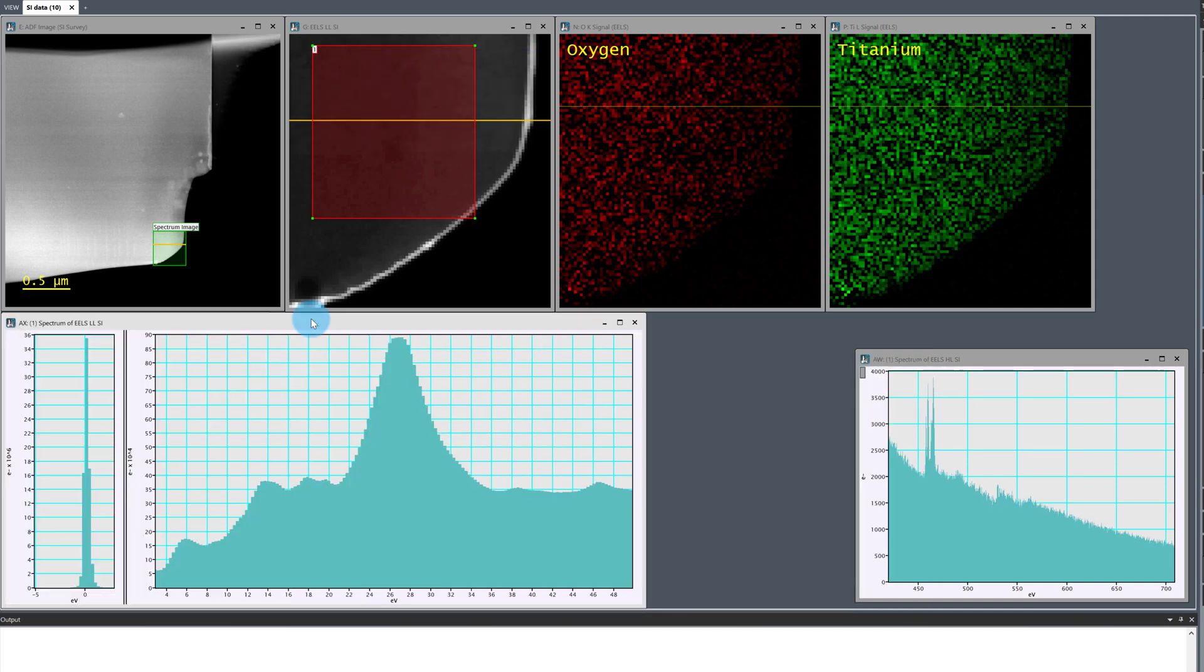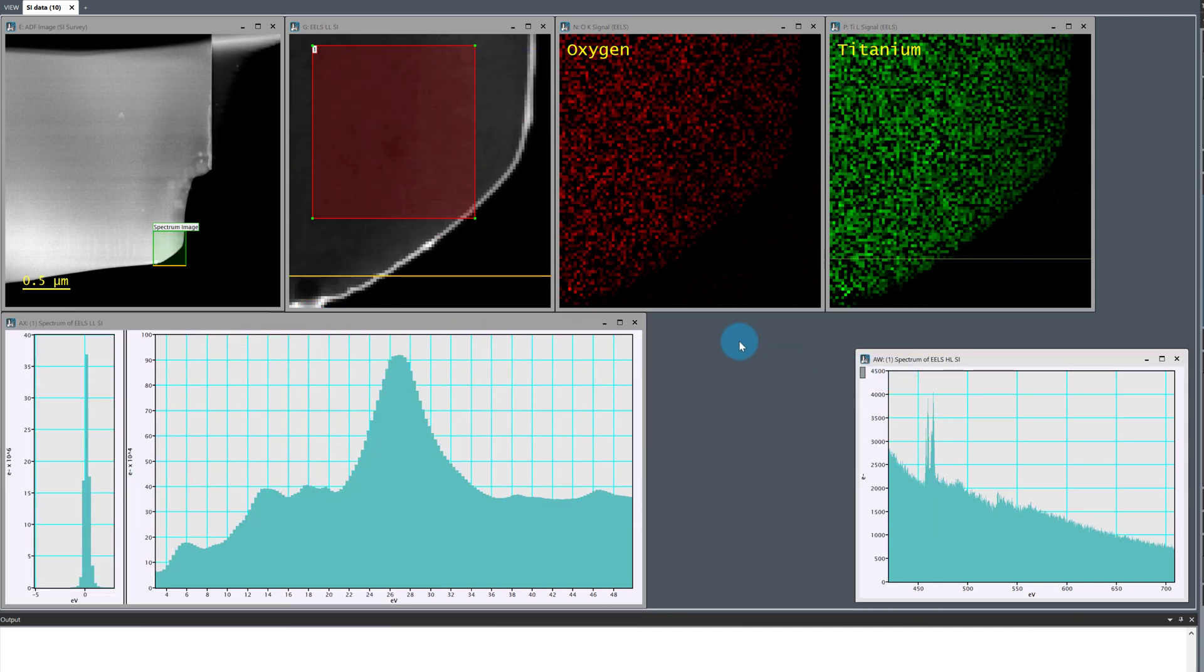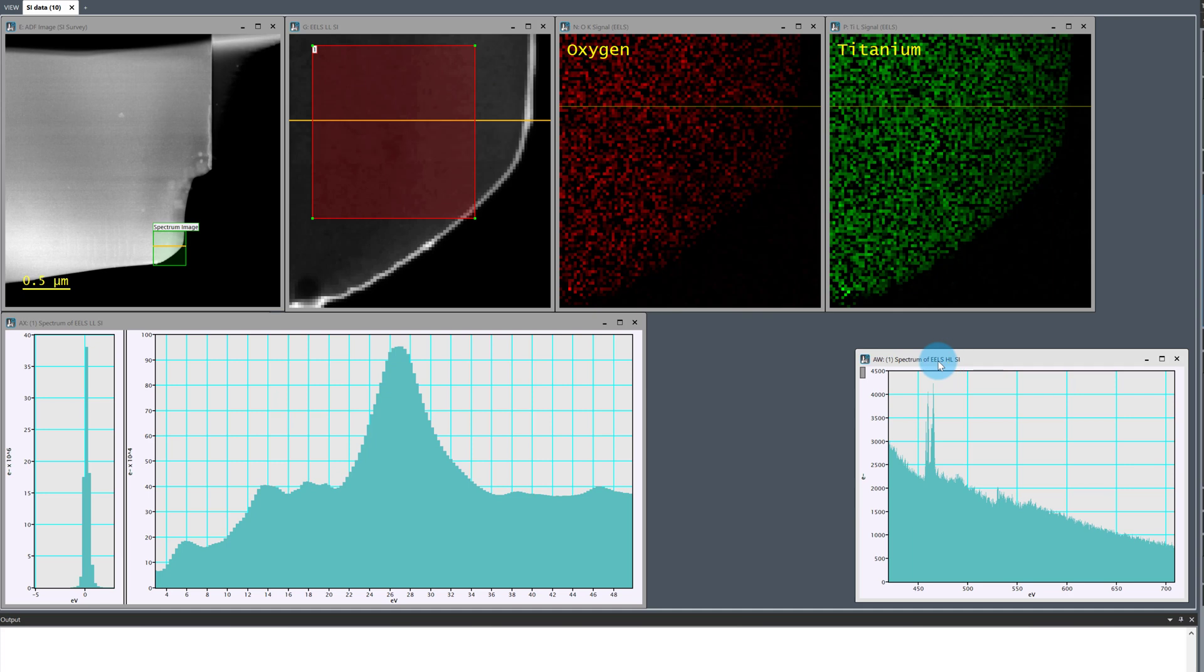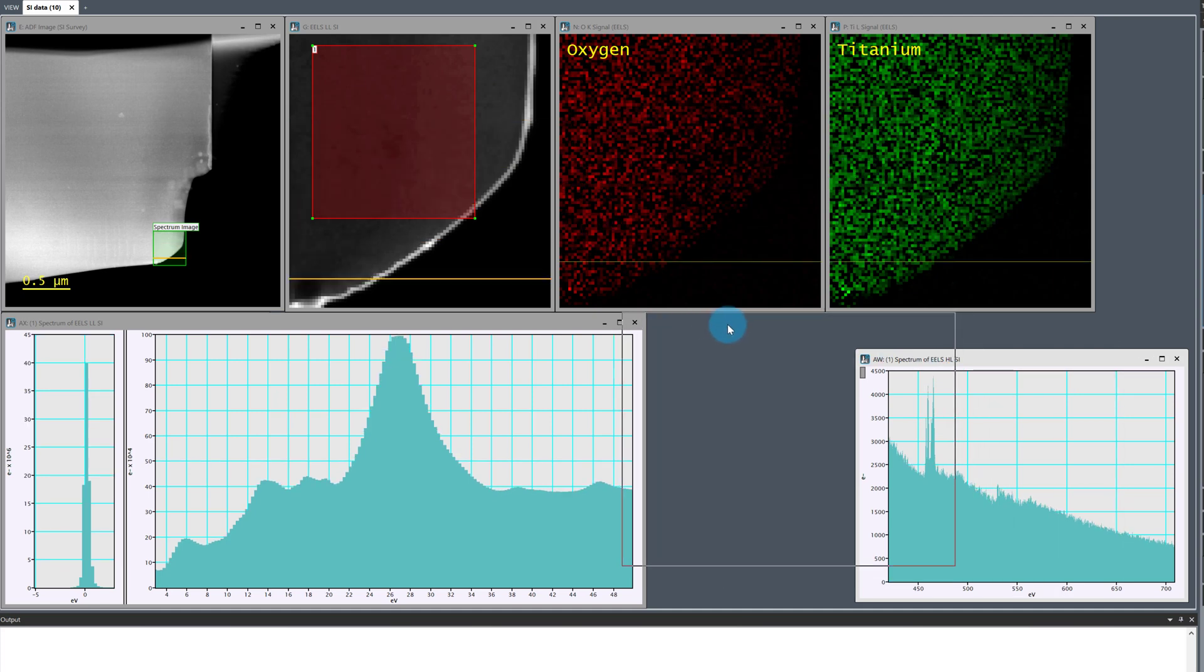As expected, I have a single channel 4 width half max in the ZLP so my energy resolution is 0.3 eV.